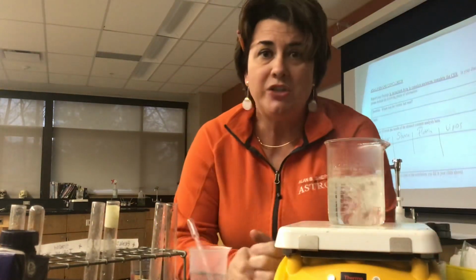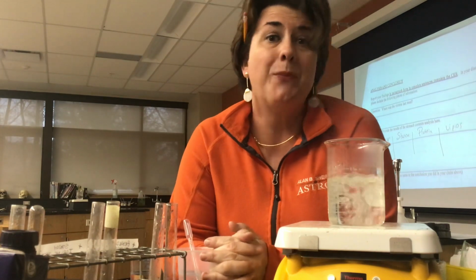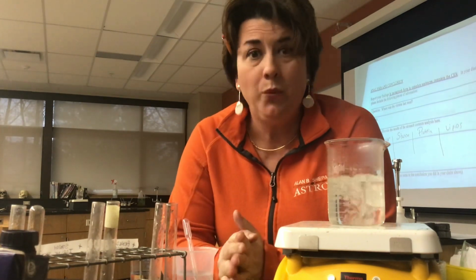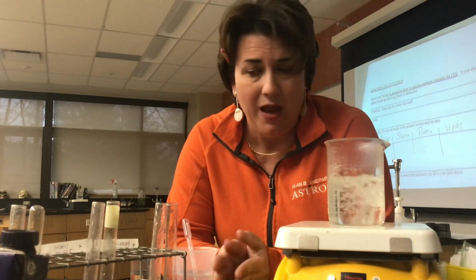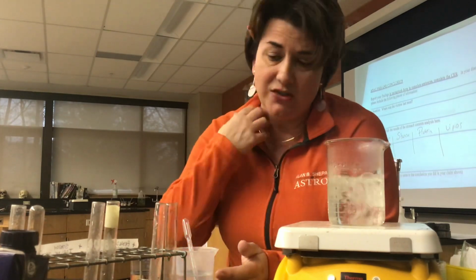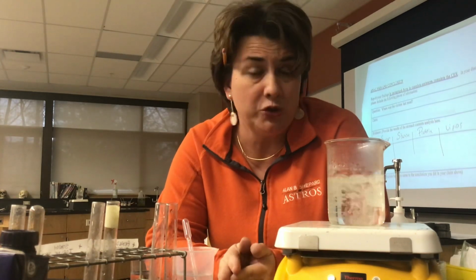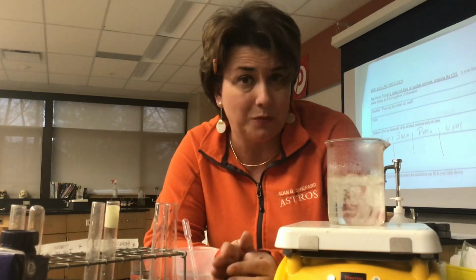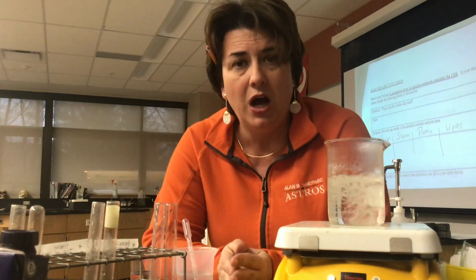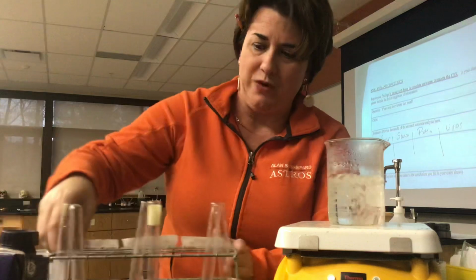Really quickly, I wanted to show you the lab that we did both on Monday and Tuesday. We did a stomach contents lab. And so part one is we decided to test the four major components of food. Those are simple sugars, starches, proteins, and fats. So what I wanted to do is show you kind of how we did this.